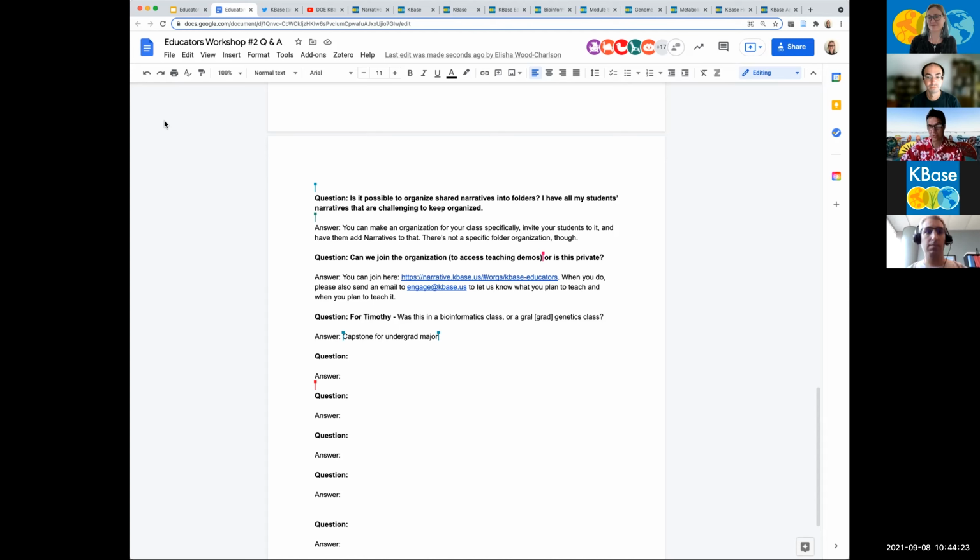They ended up using a lot of bioinformatics tools to answer their question. And that's by design, because this is one of the places they can get that information in the major. But the real focus was on the research and using these tools to actually do some novel research. Yeah, this is a really neat example of integrating both wet lab with the bioinformatics analysis itself in KBase.